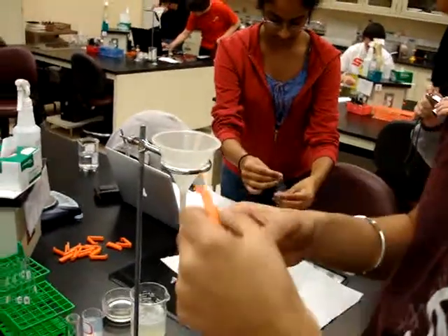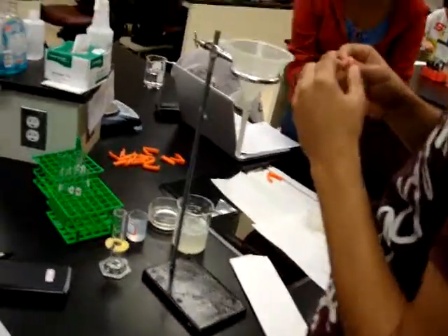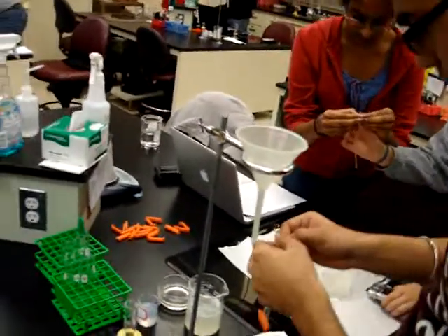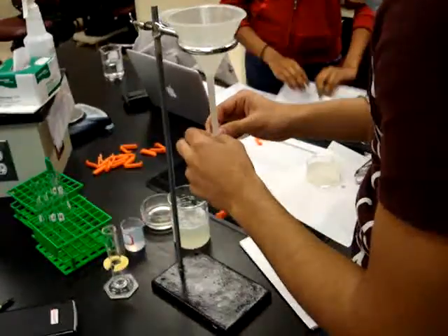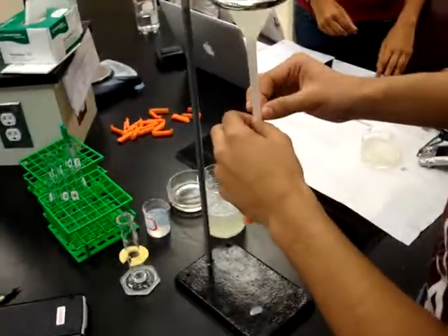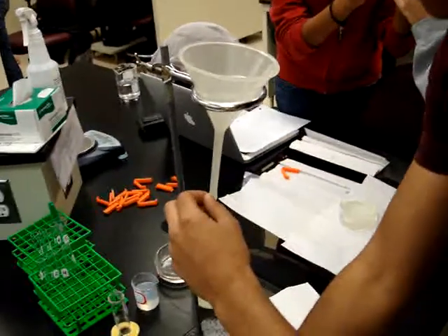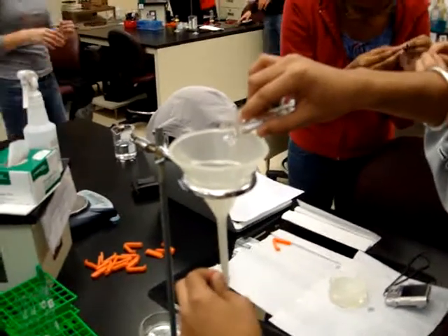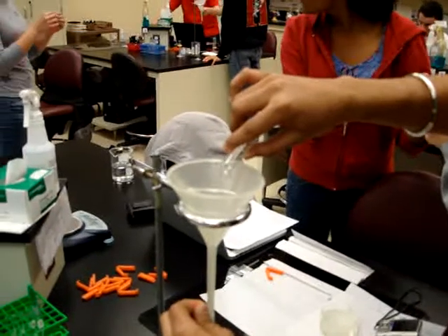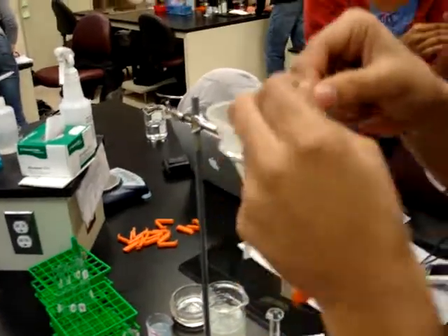You're going to add the solution. It's okay if this isn't dry now. Do not let the dialysis tubing dry out. Once you get the clips on, you've got to soak them.